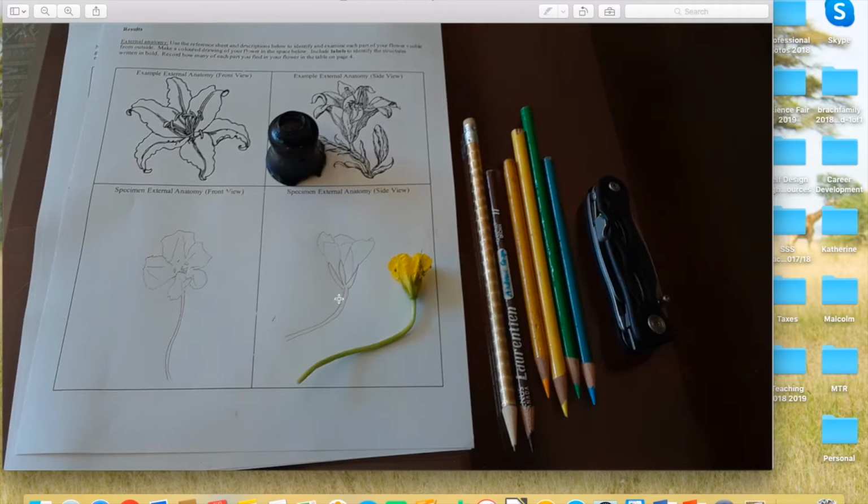Don't draw the flower that's in your head. Look at the flower that's in front of you and make lines that you think match with what the flower looks like. To me, drawing is as simple as that. It's not easy. My drawings aren't perfect, but it's a simple thing to look at what you see and to put it to paper.